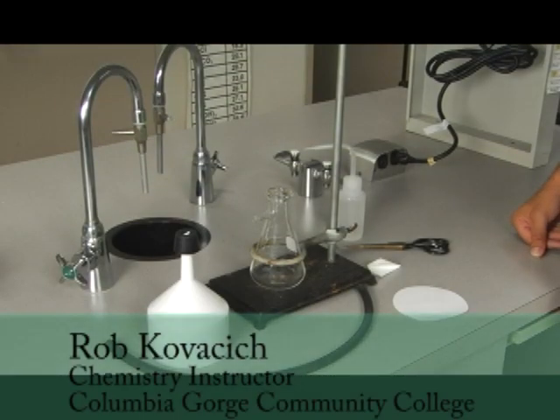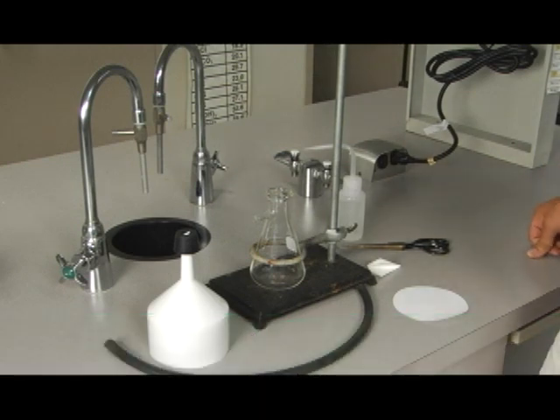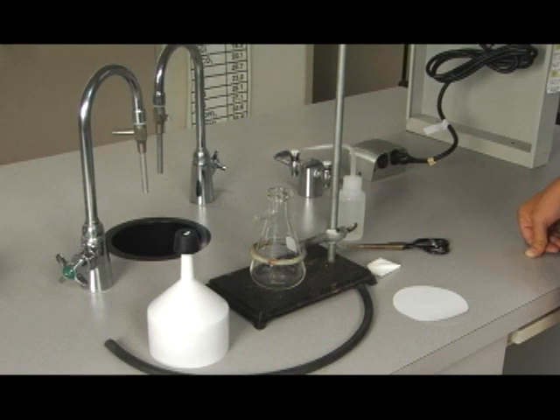This is a demonstration on how to set up a vacuum assembly. A vacuum assembly is very important when we're filtering. We don't have to wait around for hours for gravity to filter water through a filter. So what we'll do is force the liquid through using a vacuum assembly.